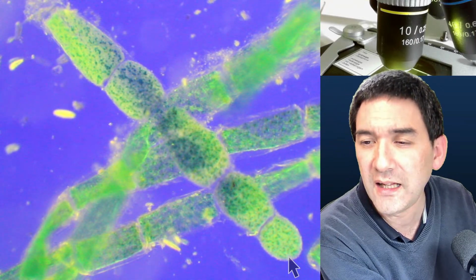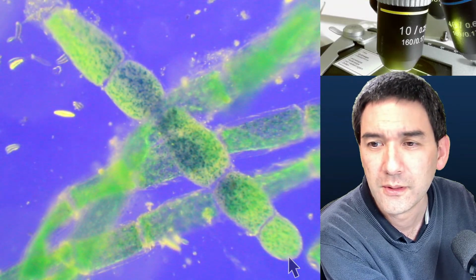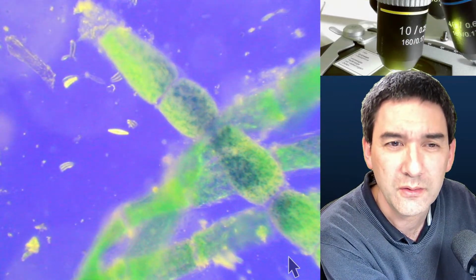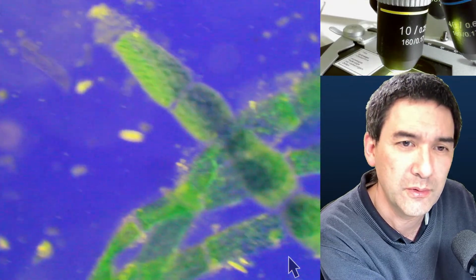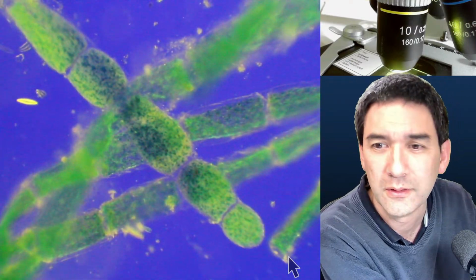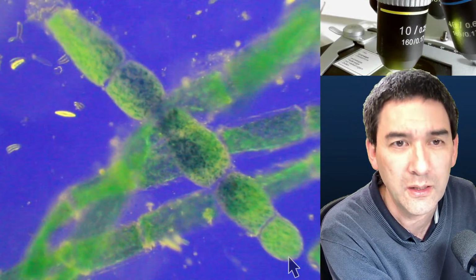Would people stain algae green to preserve that natural color? I wonder. I don't think so. It wouldn't make a lot of sense to stain it green. Generally, algae are not so difficult to obtain anyway, and for casual microscopy you just keep a jar. Maybe 20 times is the maximum. If 20 times is the maximum meaningful, I think so as well.